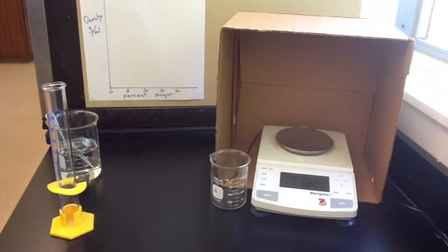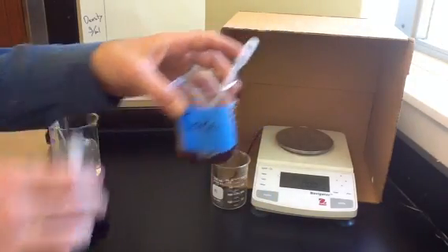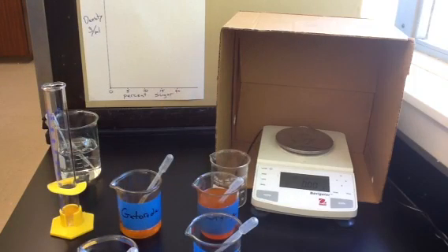This is the sugar content of various sodas lab. What we have here is various sodas. We have Coke, we have grape juice, we have orange soda, and we have some Gatorade. And we want to figure out what the sugar content of these different drinks is.